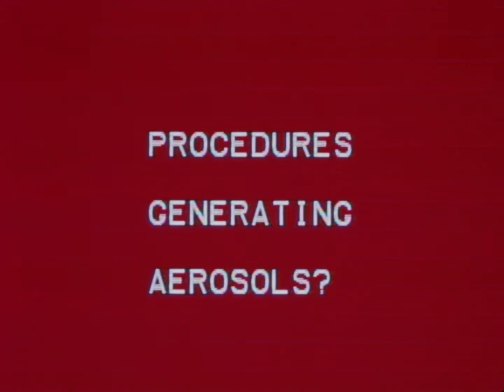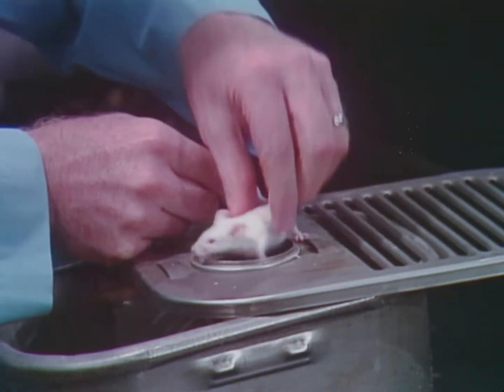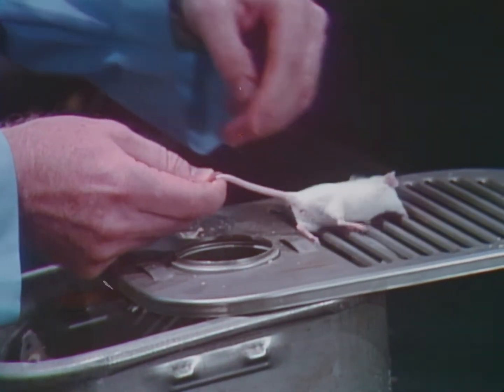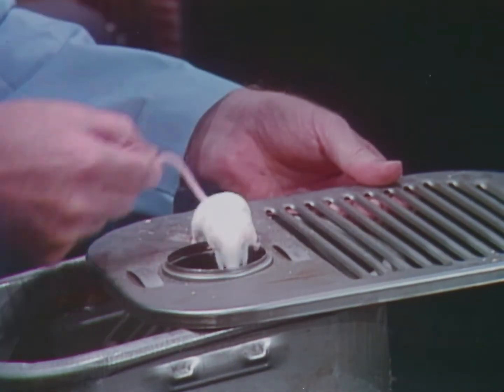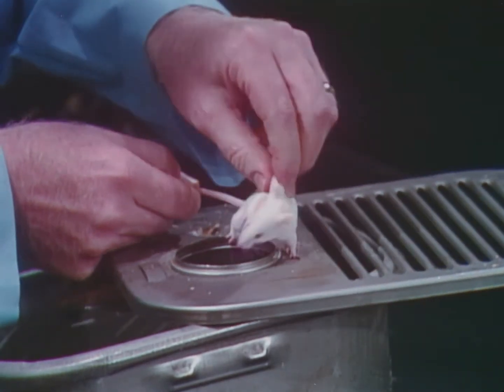We also need to know what common microbiological procedures are likely to generate infectious aerosols. We may also ask what procedures are likely to be hazardous in work with experimental laboratory animals. We have posed these questions to add emphasis to key points to be explored in this presentation.